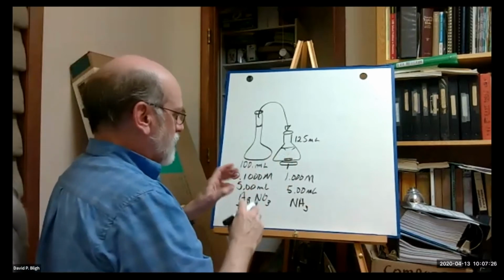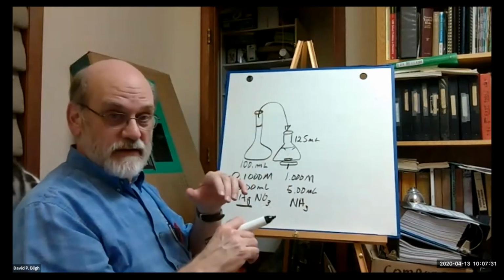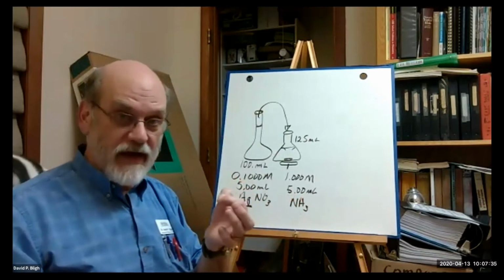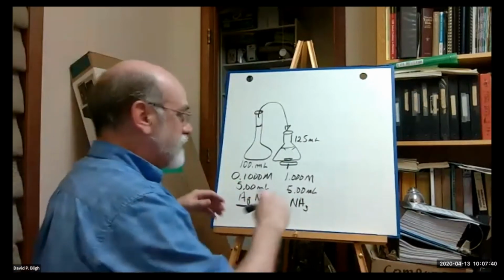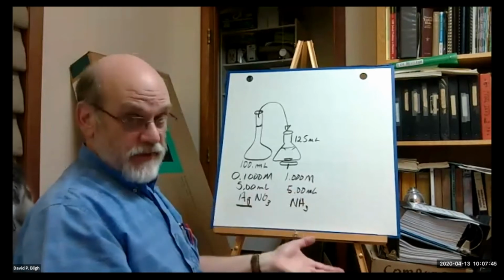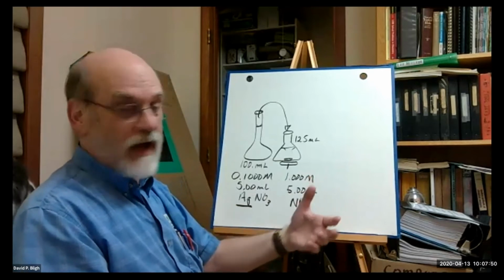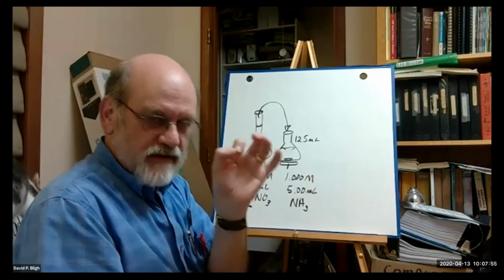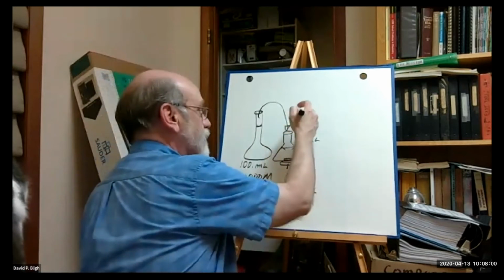So we transfer everything into that flask. Now we're going to titrate what into it? Potassium chloride. That's where our chloride ion is added from, is potassium chloride. And that will be a volume that is unknown at this time. Right? That's the whole point. We want to find the volume of chloride that needs to be added to just barely develop the first hint of silver chloride. Right? So we have a burette.